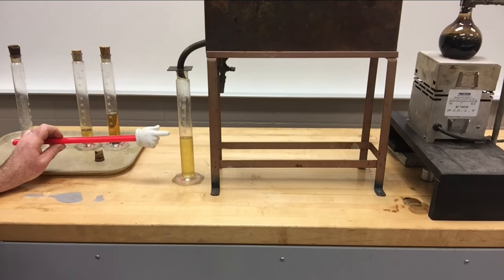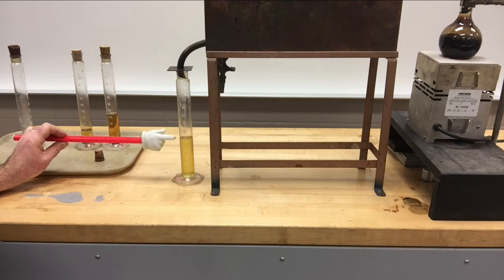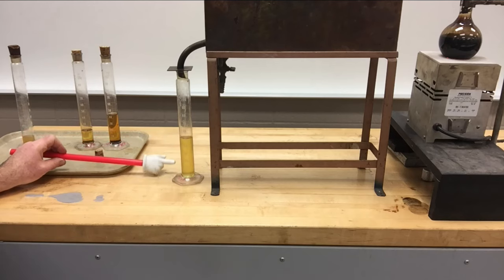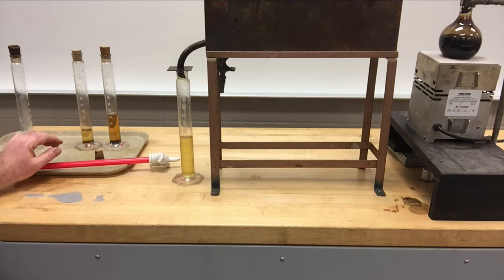Okay, we are currently at 575 degrees Fahrenheit, and we're right around 50 milliliters of diesel fuel collected. So that's 25% of our sample right now is kerosene slash diesel fuel mixed, and we still have some more to go. So while we're waiting, for our students taking this class, remember that page 9 of your laboratory manual in the back of your book, this is lab 1, has a sheet for you to fill out in relationship to all the observations that we're making on this particular sample today.